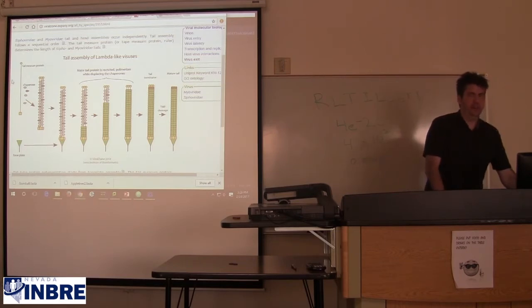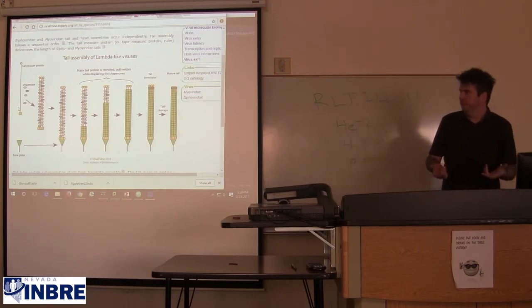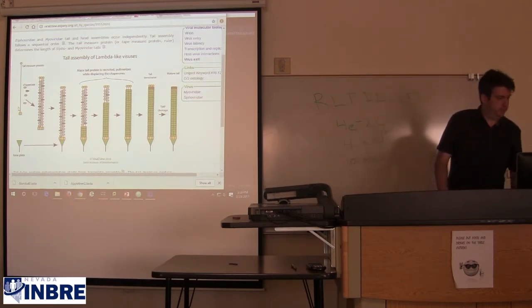And so our 1,590 letter tape measure gene should have a fairly strong relationship with the visible length under EM of gumball's tail. A shorter one should have a shorter tail. And if we have any discrepancy in that, that's a question we have to reconcile, right? Because we would have two conflicting pieces of information. We have what we can see on the slide, what we can see on the plate, versus what we think we know from the sequence. And they can't both be right if they differ.